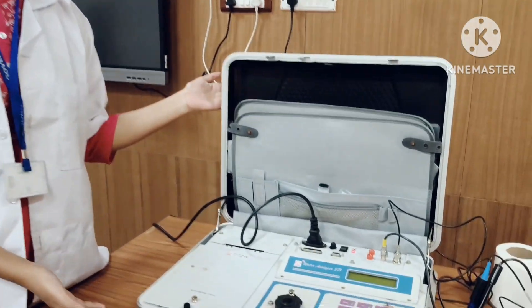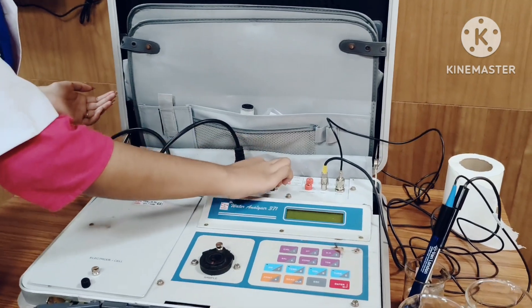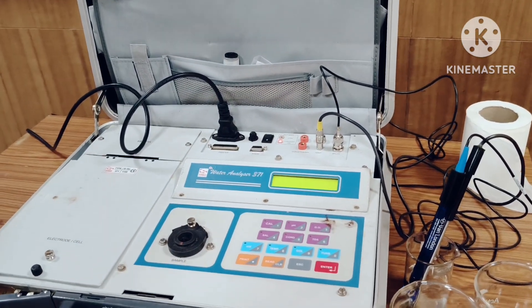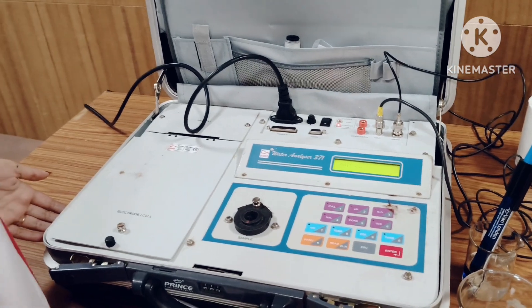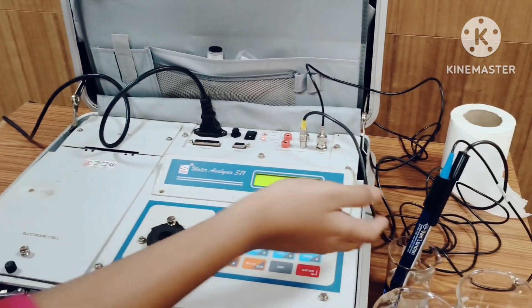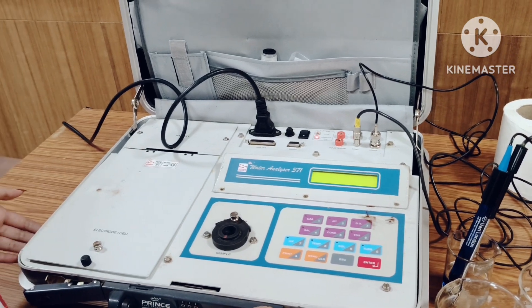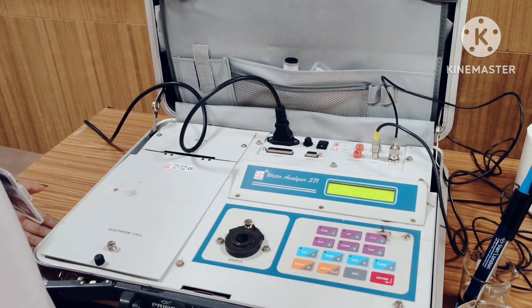This is our water analyzer. First, let's switch on the device. The first step of the whole procedure is to calibrate the pH electrode, which was previously dipped in 4 normal KCl to maintain ionic stability and for accurate readings.